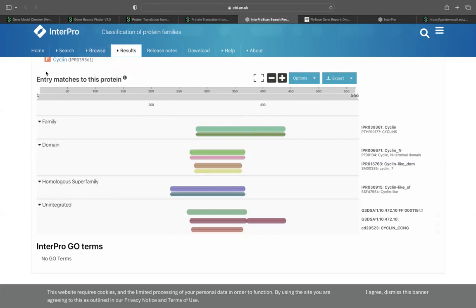That is not a technical term. That's just what I call them for ease of understanding, where we can have some changes up here and we can have some changes up here and still have a functioning protein. And by functioning, I mean an orthologously functioning protein.